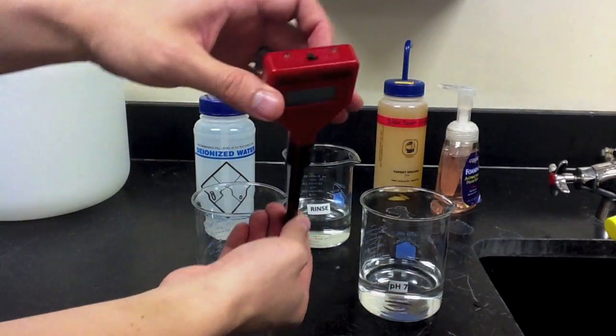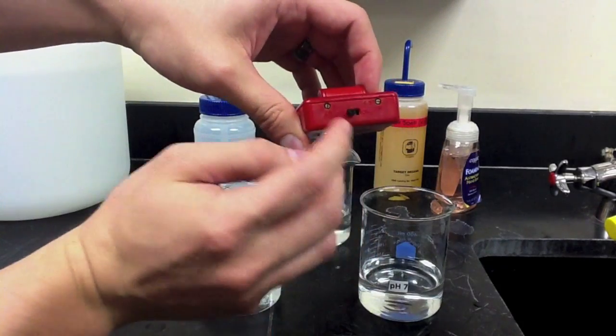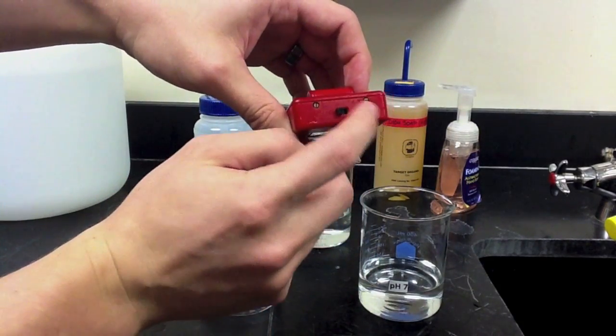If you look at the top of the pH meter, you'll see two screws, one that's labeled pH 7 and one that's labeled pH 4, 10.